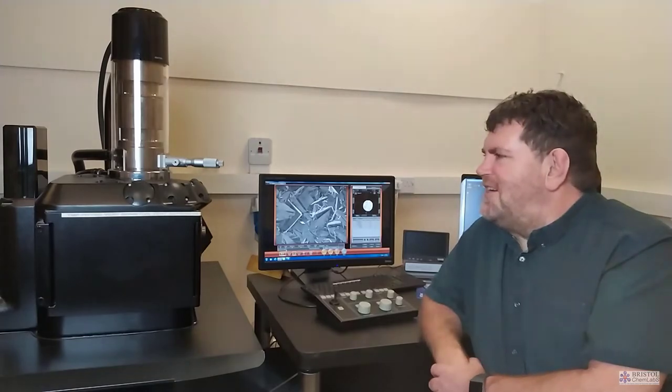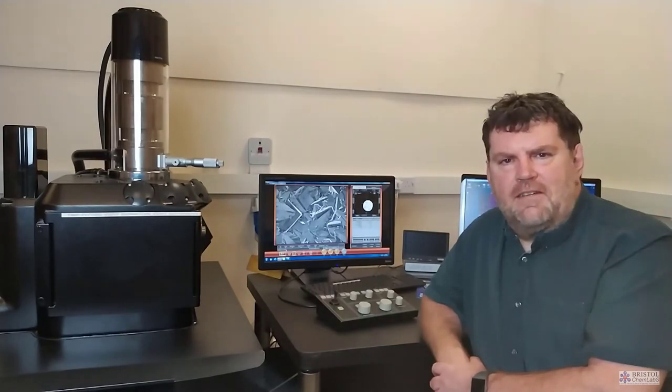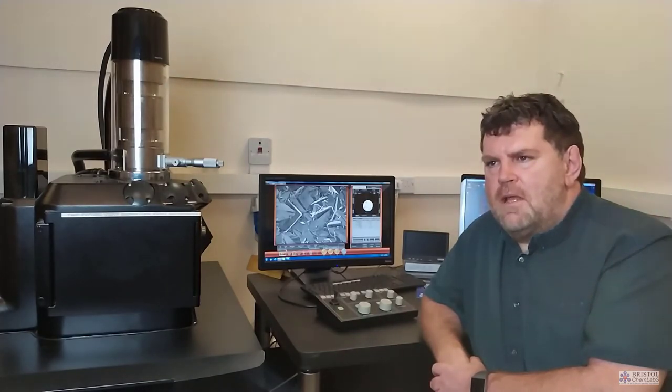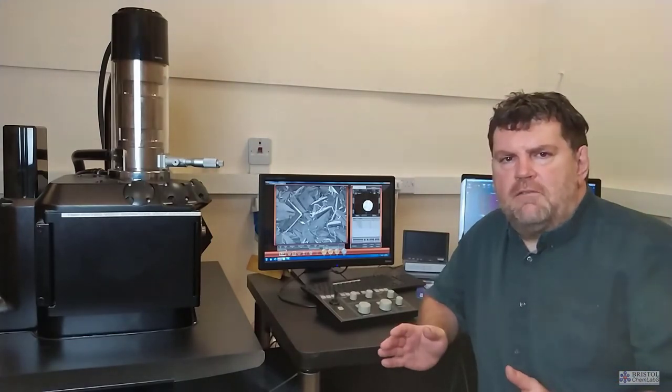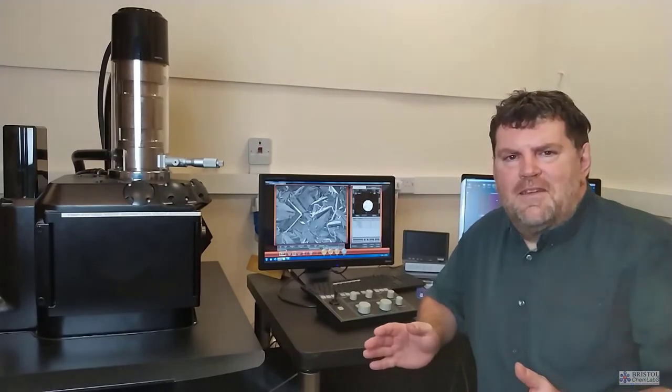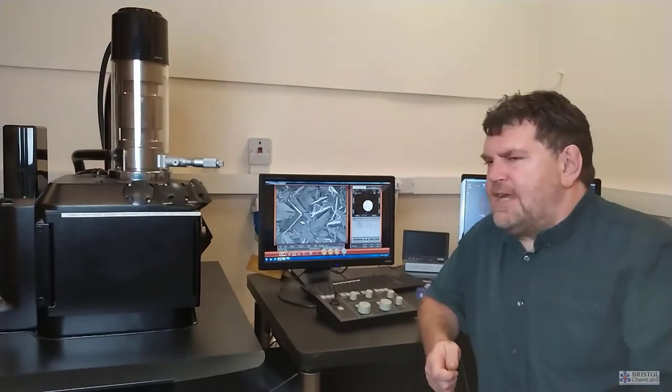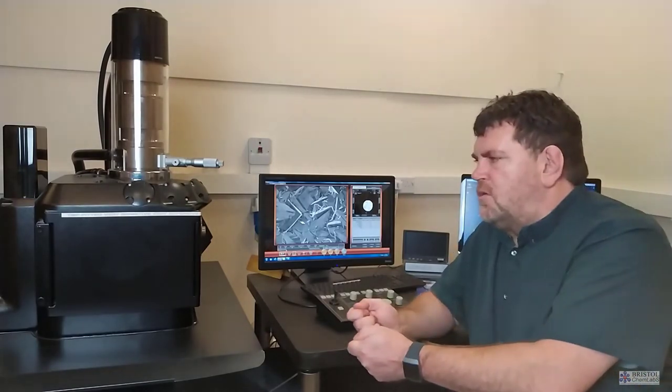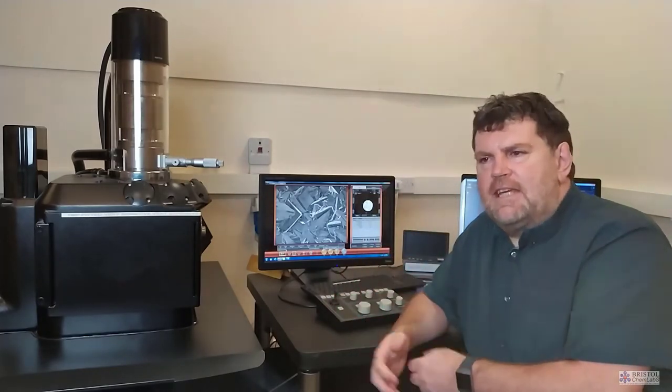Three of the strangest materials. The first one was a challenging one because it was a fossil, and it actually originated from the earth sciences department. Normally with electron microscopes, we're often having to cut materials down to be able to look at them. But with this fossil, they didn't want it damaged in any way, so it was literally a case of fitting the fossil into the column and just hoping and taking an image.